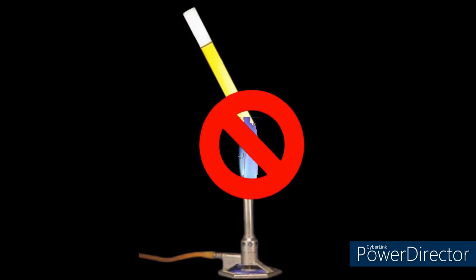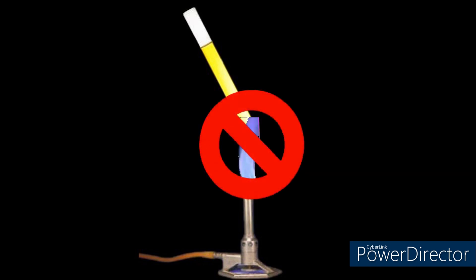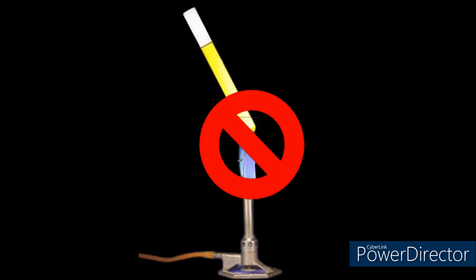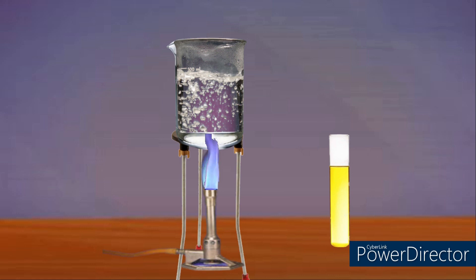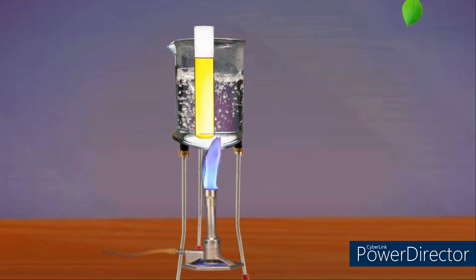Next, take alcohol in a test tube. Do not expose it directly to the flame as it is highly flammable, so heat the alcohol using the boiling water. Take out the water and put the leaves in the heated alcohol.